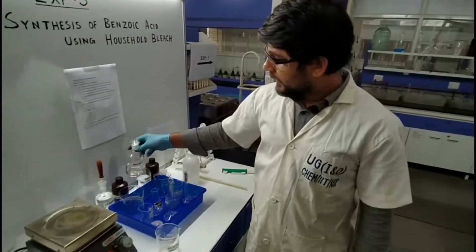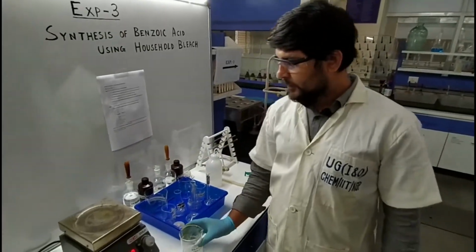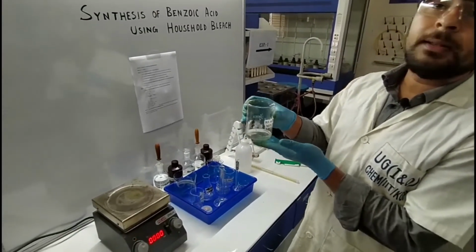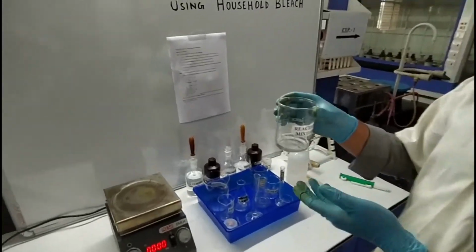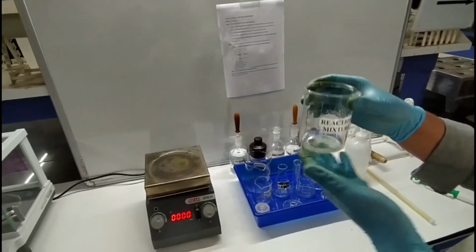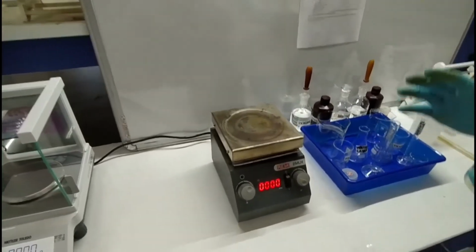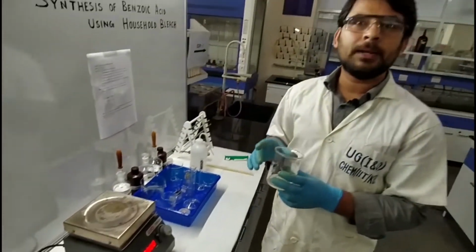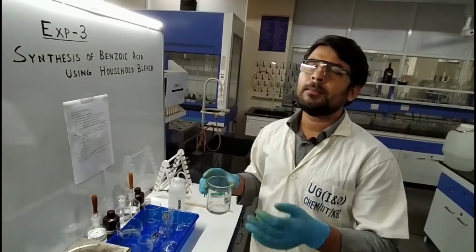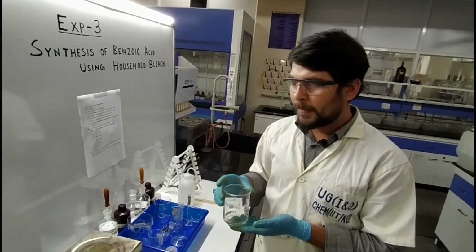Now all three reagents have been taken inside the reaction mixture container. Now we have to place this reaction mixture container above the hot plate and heat it at nearly 75 degrees, the temperature required for this reaction.